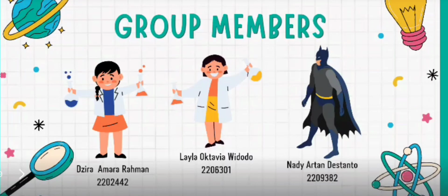First is me, Dzira Amara Rahman with ID number 2202442, and my partner, Layla Oktavia Widodo with ID number 2206301, and Nady Artan Destanto with ID number 2209382.